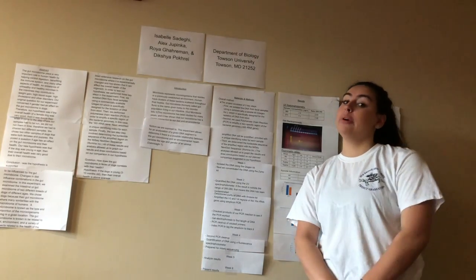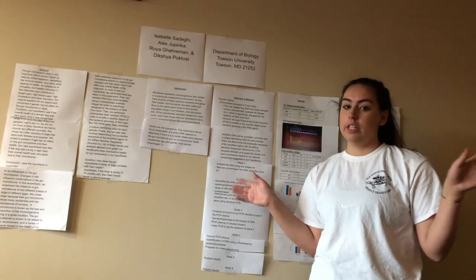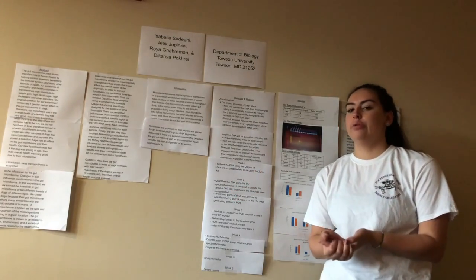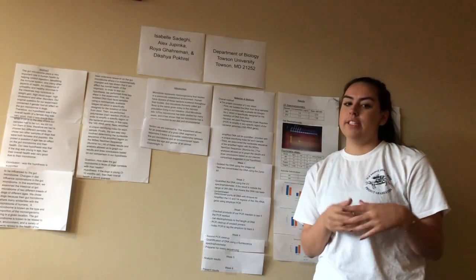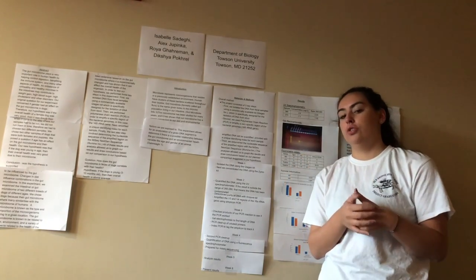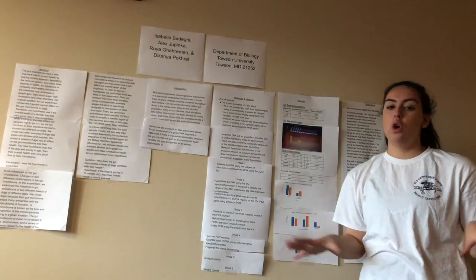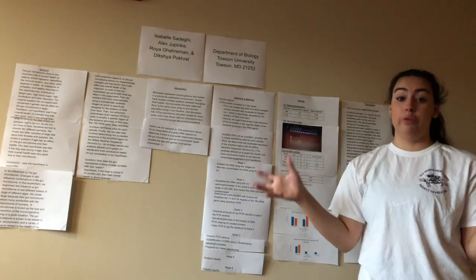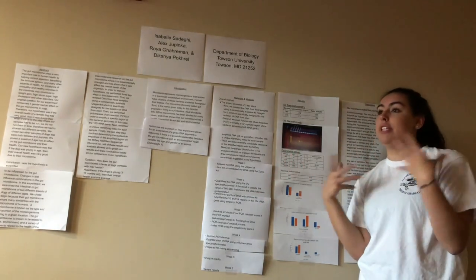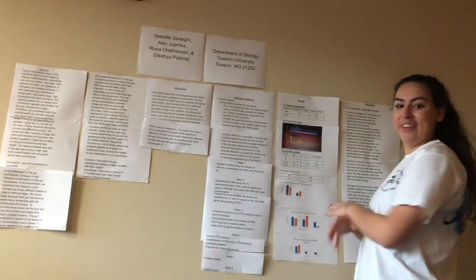So discussing the number of successful reads in each of the animals compared. There were no successful read amounts in the animals that we compared and did analysis on. There wasn't a high enough concentration to get a proper read of any of our samples. So discussing the differences between the gut microbiomes of the group of animals that we chose and comparing them at the kingdom, the order, and the genus, as we did here.